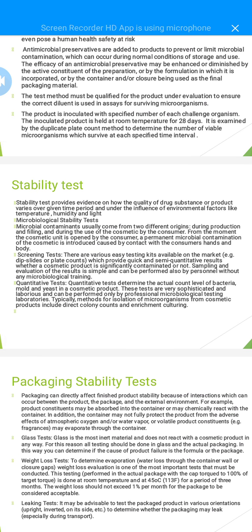There are various easy testing kits available on the market, for example, dip slides or plate counts. The dip slide test is used to check the presence of microorganisms in liquid, and dip slides are incubated at 30 degrees temperature for 48 hours after they are dipped into the sample to ensure the result.